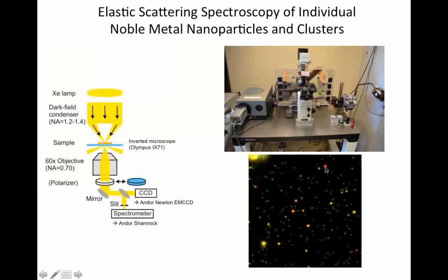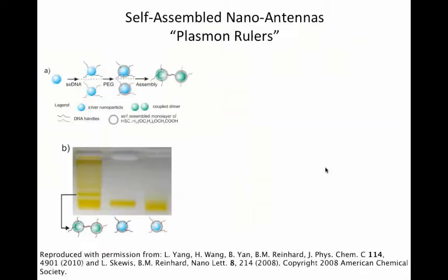These spots belong to nanoparticle clusters, because due to electromagnetic coupling between the individual particles, the plasmon, which is a collective electron oscillation within the particle, obtains a redshift of the resonance. And this electromagnetic coupling, which is distance dependent, is used in a broad range of analytical applications.